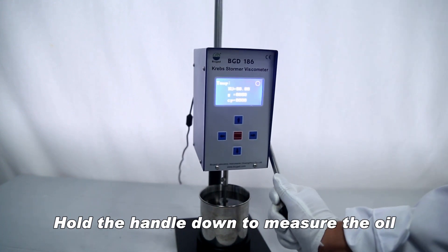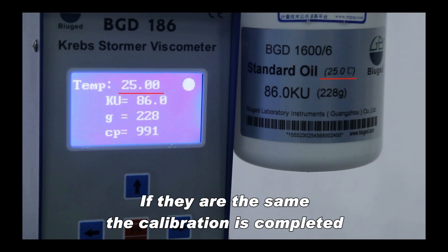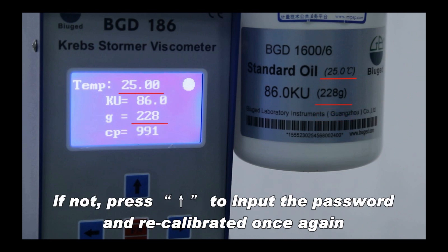Lift up the handle to stop the test, then hold the handle down to measure the oil in order to check whether the testing value is the same as the standard value. If they are the same, the calibration is completed. If not, press to input the password and recalibrate it once again.